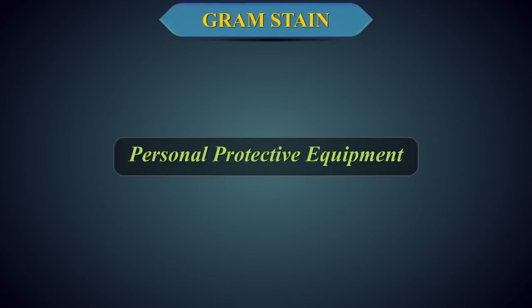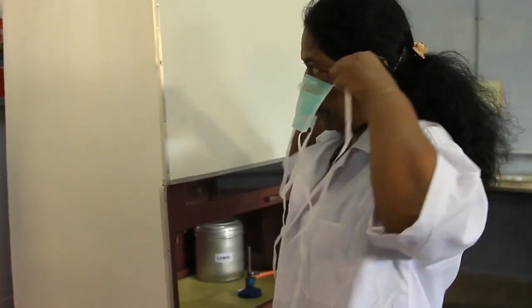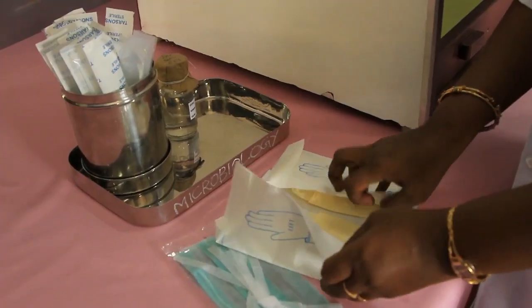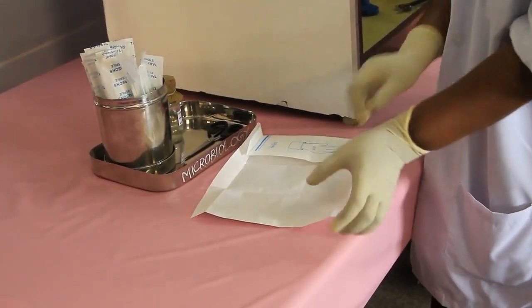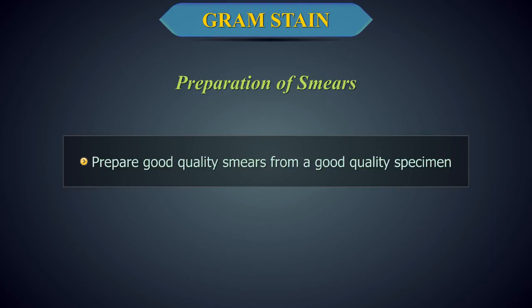Gram's stain. Before commencing any laboratory procedure, make sure that you don the apron, mask, and gloves. This is mandatory. Preparation of smears. Before proceeding to staining, it is important to prepare good quality smears from a good quality specimen.